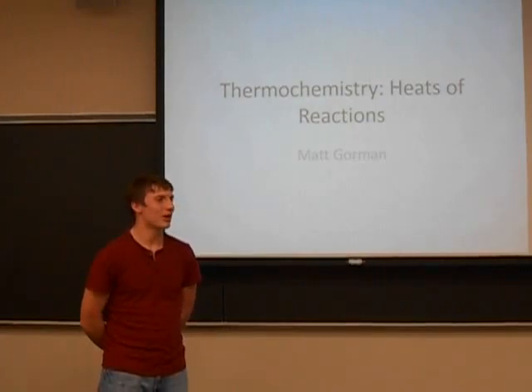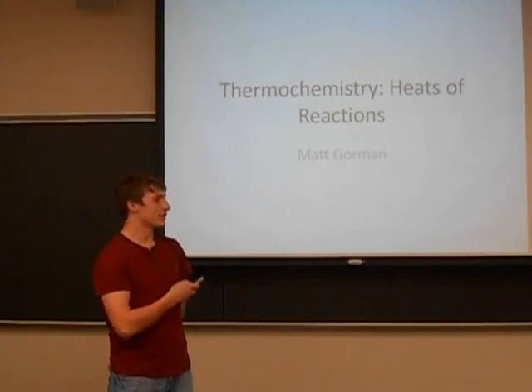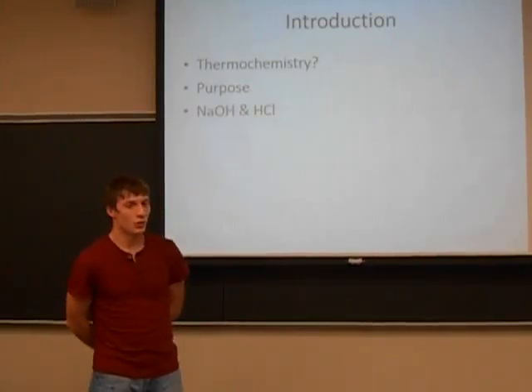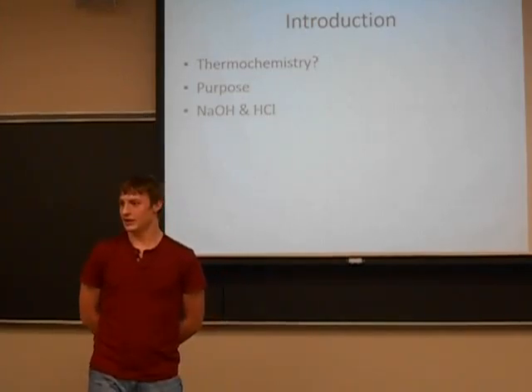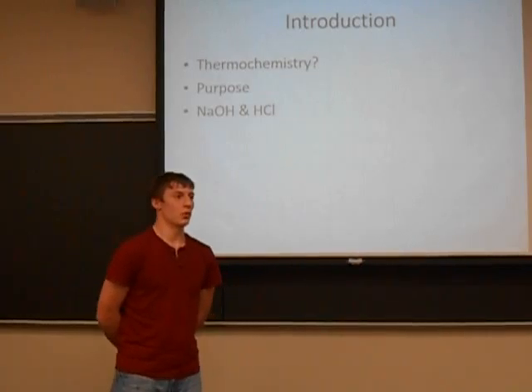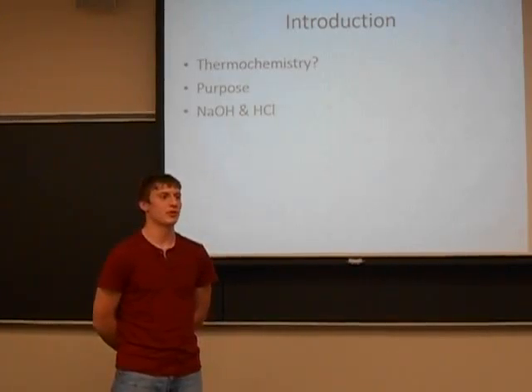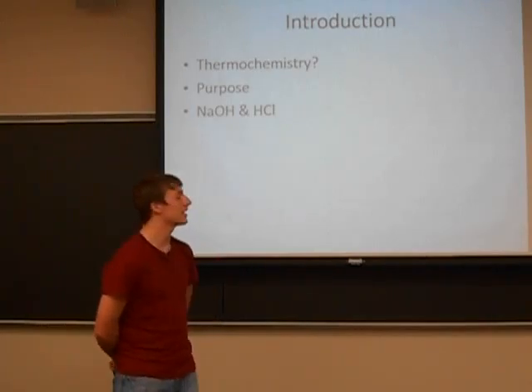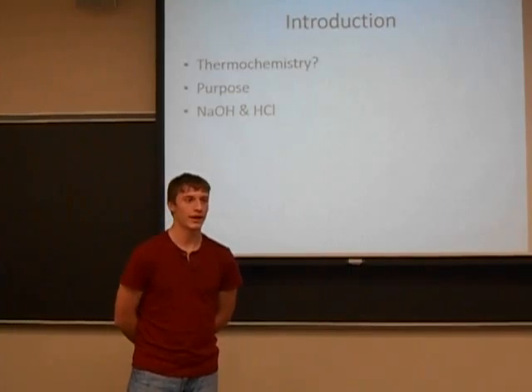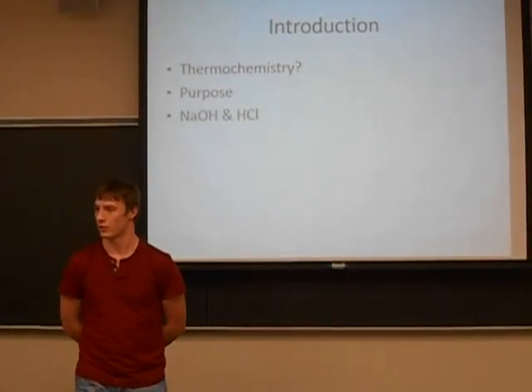Today I'd like to talk to you about experiment number 10, thermochemistry, heats of reaction. So let's start off by discussing what thermochemistry is. Thermochemistry is the study of how heat changes in reactions, dealing with Q values and heat constants. The purpose of this specific experiment was to react sodium hydroxide and hydrochloric acid to find out the specific heat and the specific heat of reaction for this reaction.